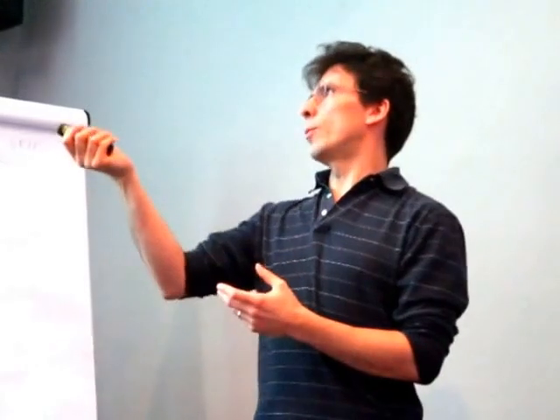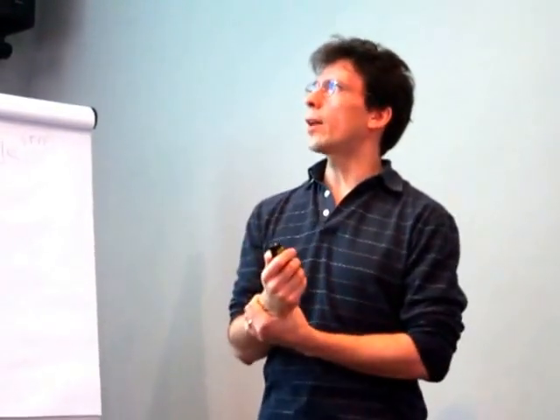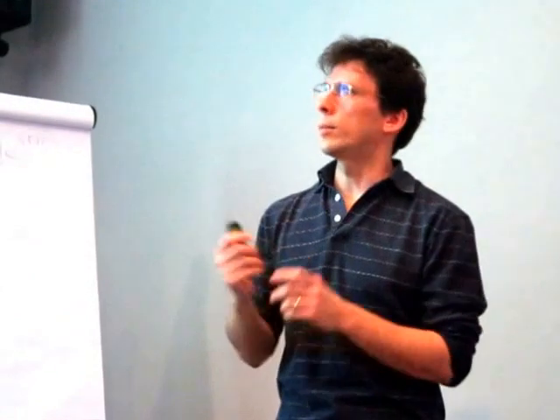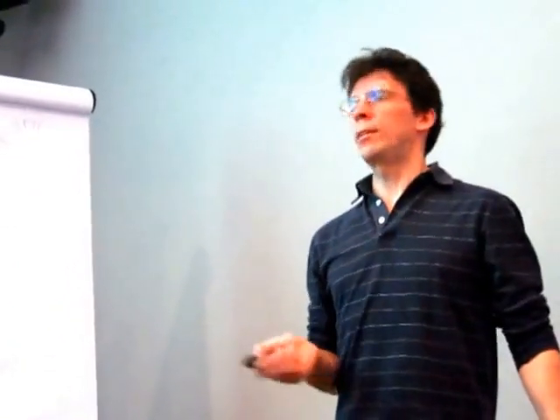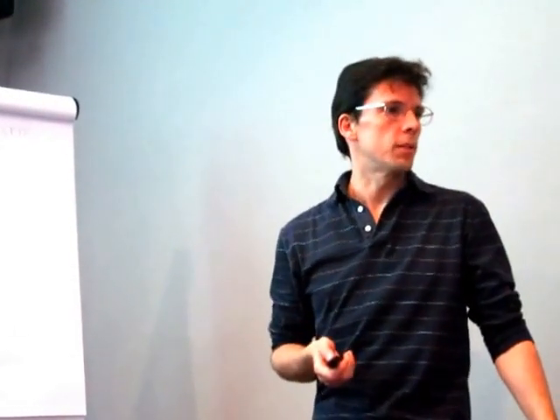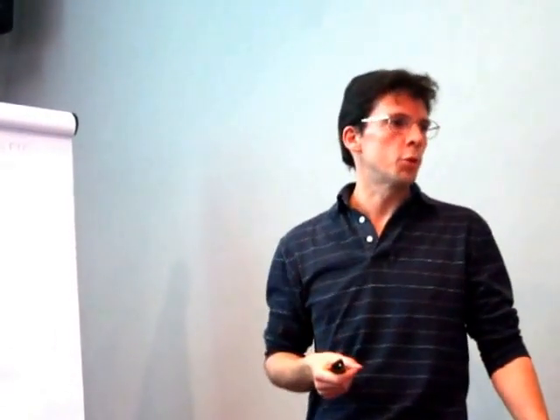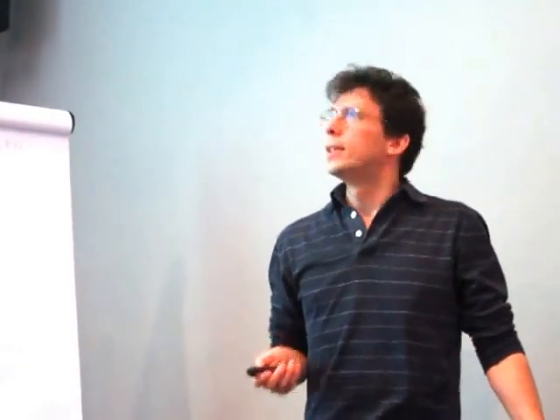And then you may apply this amplitude correction to, if you want to go to high resolution, definitely you have to do an amplitude correction for the CTF effects on the data. And then overfitting is again one of the battle horses in this field. So trying to avoid overfitting, especially now that everyone is trying to get 2 angstrom resolution, you have to be very careful with overfitting. So that's all.